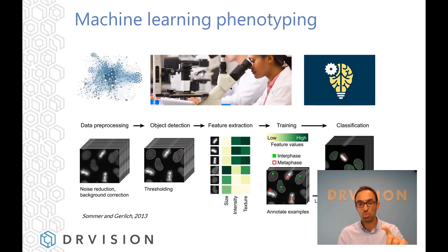Individually one tree will have a high error, but if you use a random forest, you're creating hundreds or even thousands of decision trees. Each one of them is different from the other, and as a group they are extremely robust at correctly classifying an object. So that's what we do. We create the random forest when you hit the button teach, and then you can apply that random forest, which is the classifier, to new data sets.